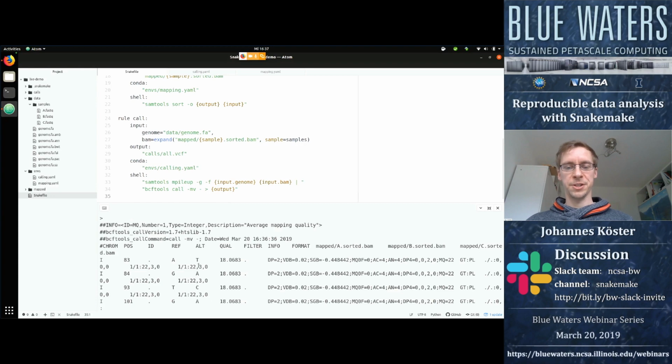But for non-bioinformaticians, we just have some features extracted here. And these features have a special column here called qual, which basically shows you the posterior probability for this to be actually a true call, okay? And this is scaled in some kind of scaling called Phred scaling. So it's a special log scale, basically meaning the higher this quality is, the more sure the caller here is that this is a true variant. So this is a true signal and not noise. Okay, but that's all not so important.